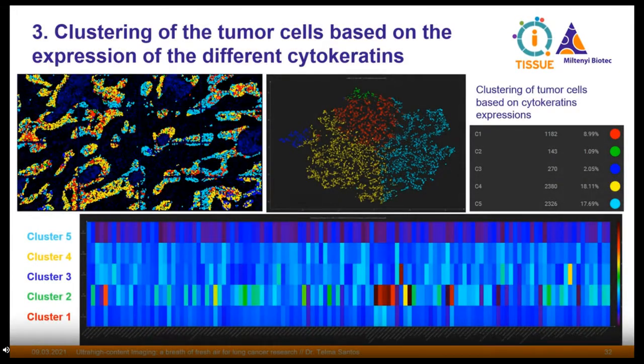I would like to now present a very quick last strategy. So of course you can do all these manual gatings as well, just to choose the cells that you already know are there, that they exist, and observe how they organize between each other and what kind of content they have in it.